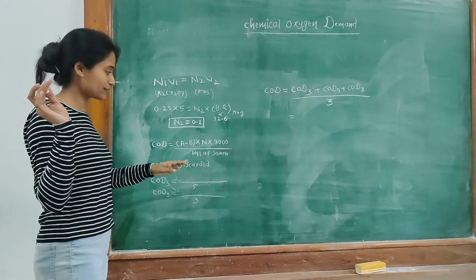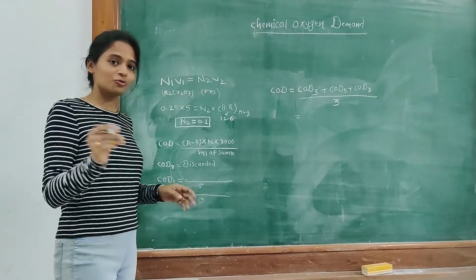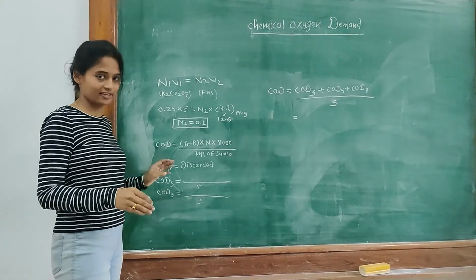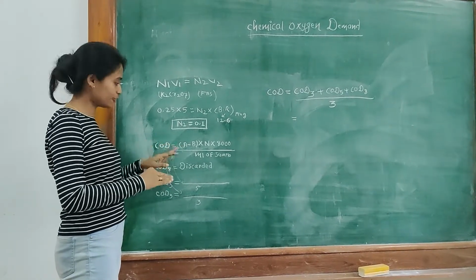And in the chloride experiment, what was the case? You just go through your procedures and see for yourself. I am not going to discuss that here in this experiment. Whatever the case, you will just put the values here.